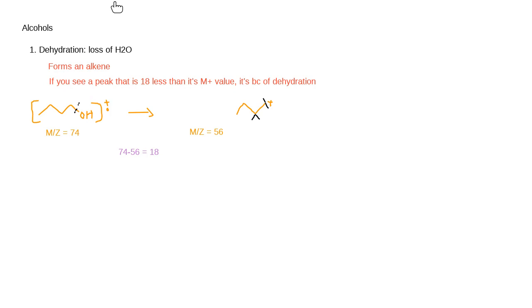So instead, we're going to create a double bond between those 2, and now it only has 1. And the extra hydrogen doesn't come from here. It comes from when we turn it into a double bond. That's how we cleave it.